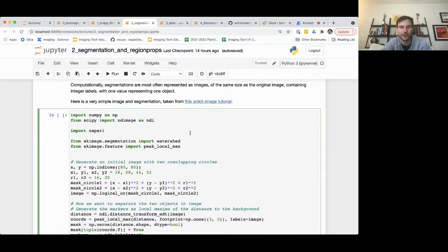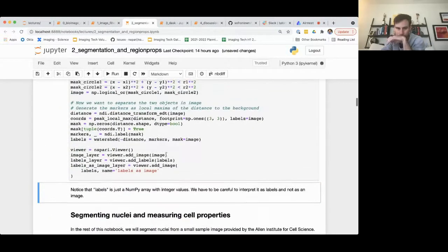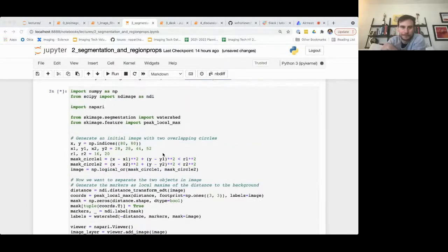That's actually going to be quite a bit of stuff that's going to happen. Okay, so I've actually run this. You see I've actually launched Napari as well. It's opened in a separate tab. Let me walk through a little bit about what we're doing here.